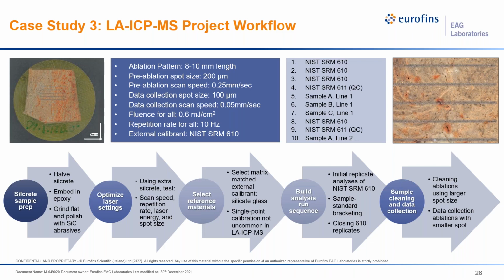But we see that it actually works. We were able to tell the sources apart. So even though this material is pretty far from optimal, that's actually why we picked it. Just to see how far we could push using laser ablation on a non-ideal material.